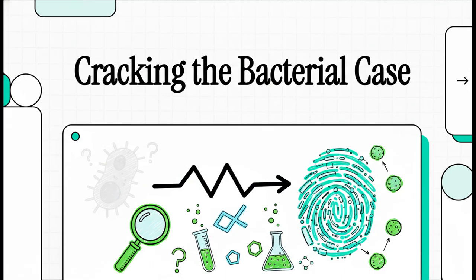So, in the world of microbiology, you've got this really unique challenge. How do you identify a suspect you can't even see? A suspect you can't exactly sit down and question? Well, in this explainer, we're going to find out. It turns out you do it just like a detective. You follow the evidence they leave behind, cracking the case by uncovering their unique metabolic fingerprint.